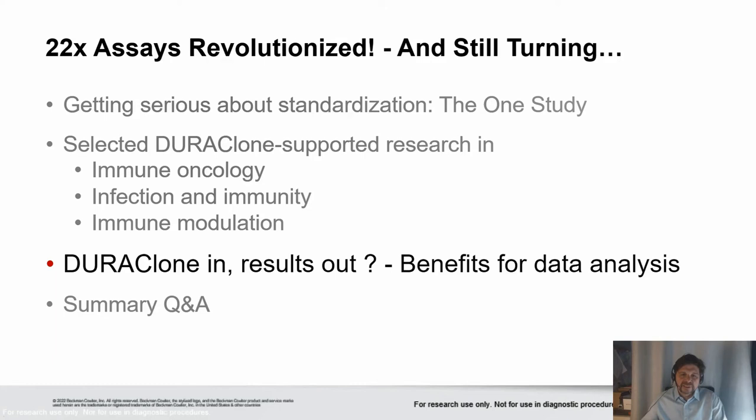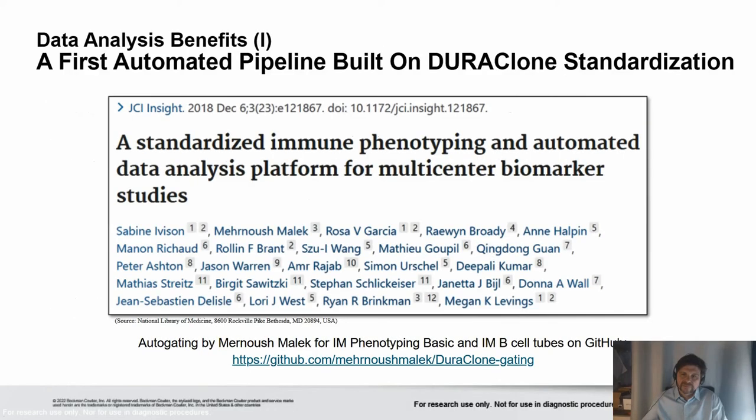These were the examples. I now would like to add a couple of comments also of a more general nature regarding the results that you would obtain with standardized phenotyping assays, such as the DURAClone assays. What is the impact on data analysis if you rely on this quality of data production?